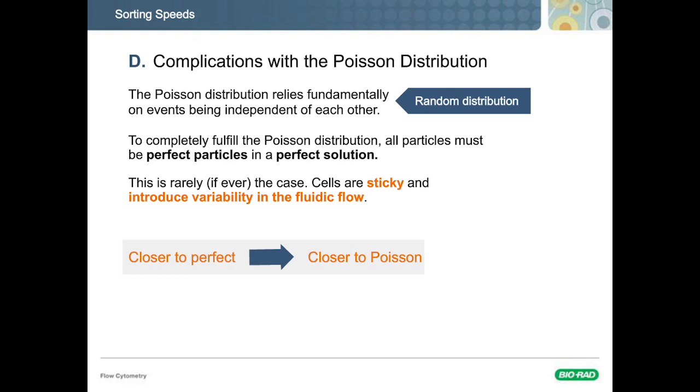If it's not perfectly random, you start to be non-Poisson, as everybody tends to say, and you are clumpier, and so you have higher probabilities of having contaminants in with the cells that you want. And this is where the instrument efficiency is great to look at, because it's going to tell you what you're really getting. You predicted that you were going to be at 84%. You're really getting 75%. That's not too bad. You might be happy with that.